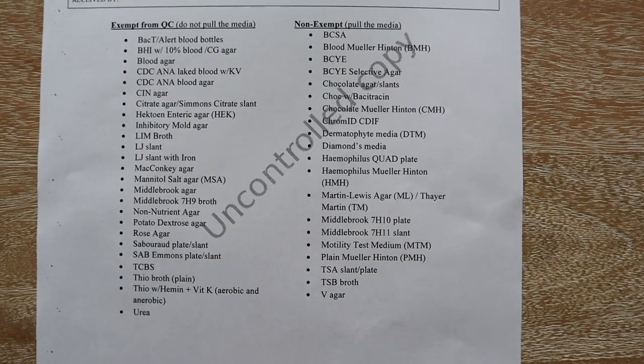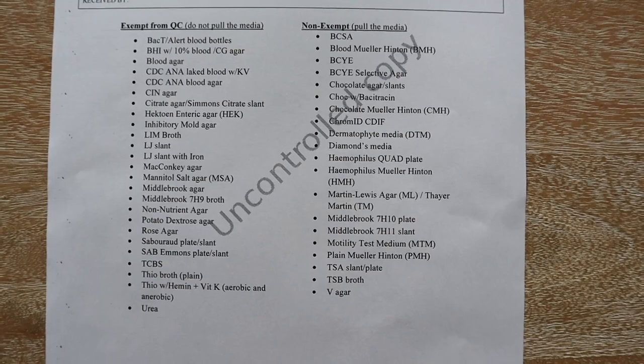And so the whole principle behind it is that you have exempt and non-exempt media. So what we have to do in the lab is when we receive media, so blood plates, BCYE plates, etc., we have to go through and quality control the ones that are non-exempt. And I'll put a picture up of the different plates that are non-exempt versus exempt.